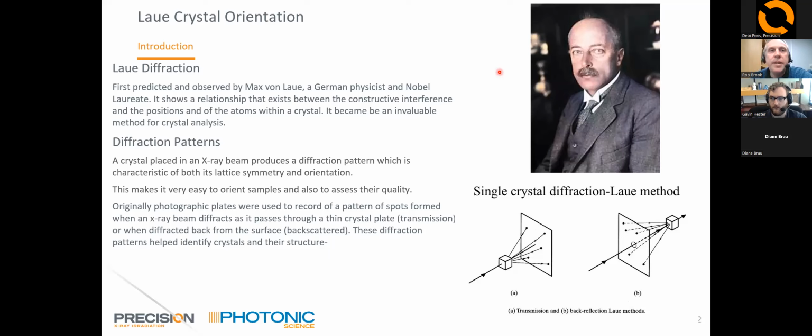This technique has been used for maybe 90 to 100 years or so in this form, using photographic plates to study crystals. It's perhaps not as popular as other techniques. It's quite complicated to analyze the results, and it takes time and patience to acquire the images and analyze the patterns, which used to be done by measuring the spots in the image and referring to charts, etc.